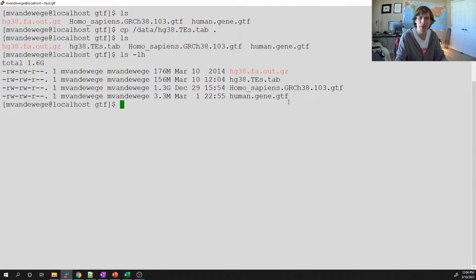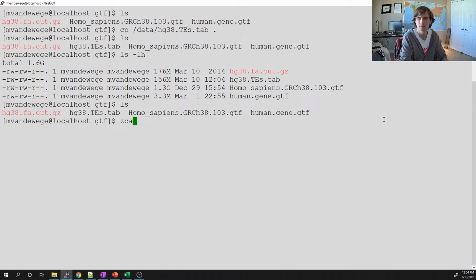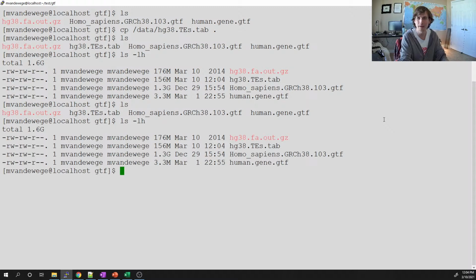And another difference between where I stopped in the last video and now is I unzipped this HG38FA. Oh no, that's not it. I unzipped the GTF. So I just gunzipped the Homo sapiens GTF. Where am I at? It won't let me because that's not a gzip file. Anyways, so those are the only things that are different. I still have my human gene GTF file that's just all the locations of the start and stop of every single protein coding gene. And now I have a TE file as well.